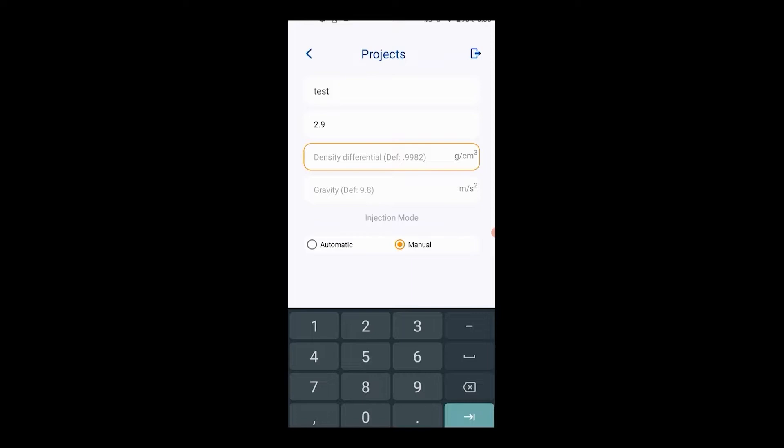so we can leave it at its default value. In case you are doing liquid and liquid measurements, for example oil and water, the value will be the density of oil being used minus the density of water.